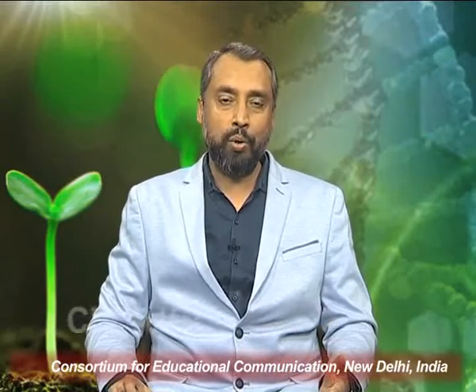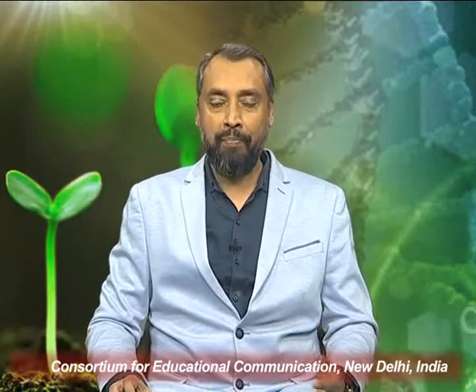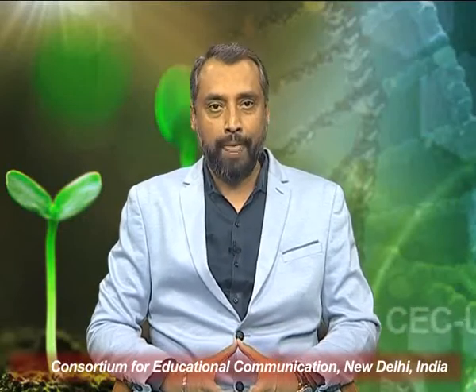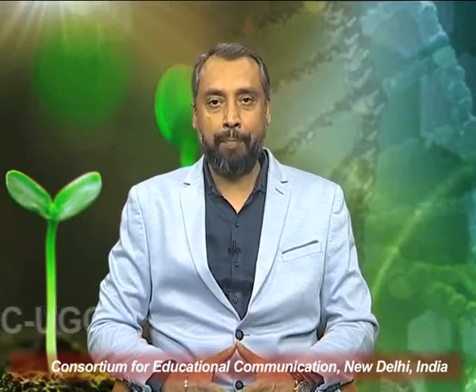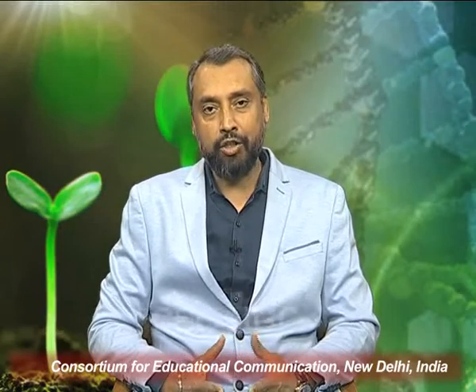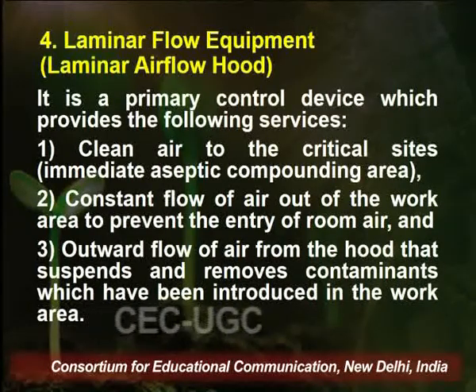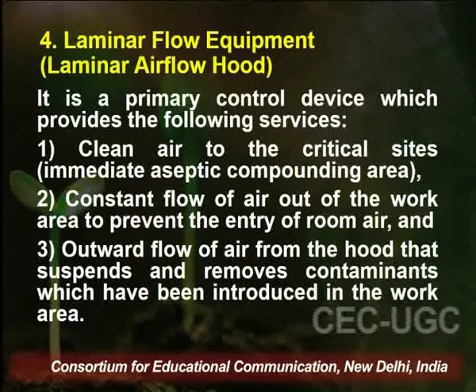Now we shall move on to one of the most widely used equipment in any tissue culture lab. To transfer any material in a very sterilized condition, we use an equipment also called laminar flow equipment or laminar airflow hood. Laminar airflow hood can be abbreviated as LAFH, and it is a primary control device which provides multiple services, such as it provides clean air to the critical sites, which are immediate aseptic compounding areas.